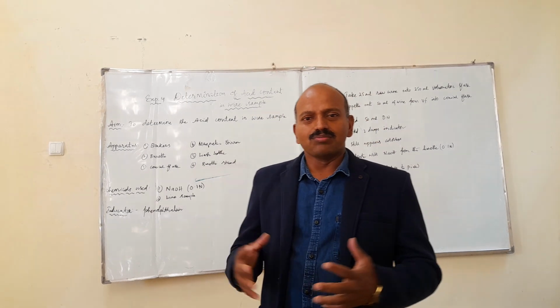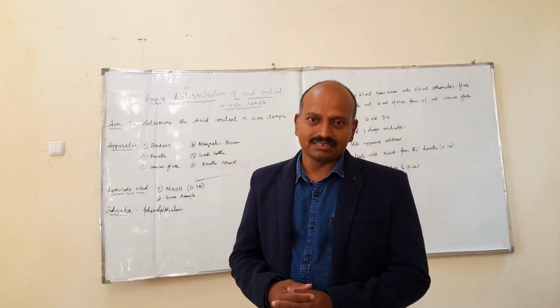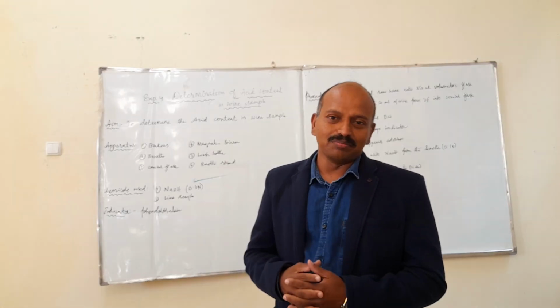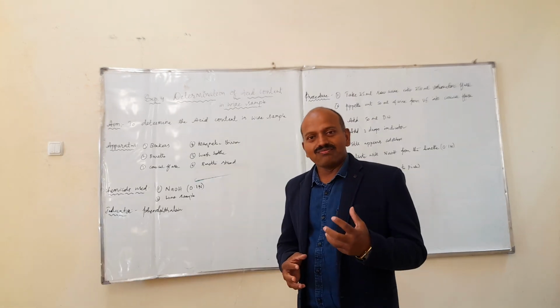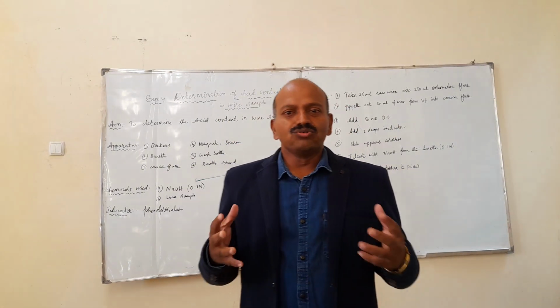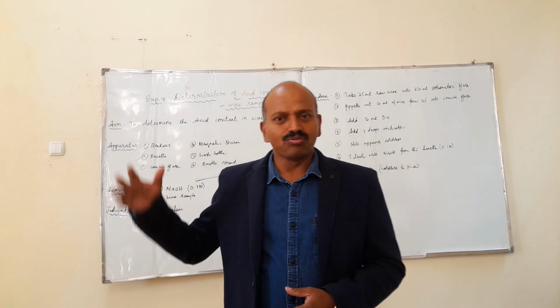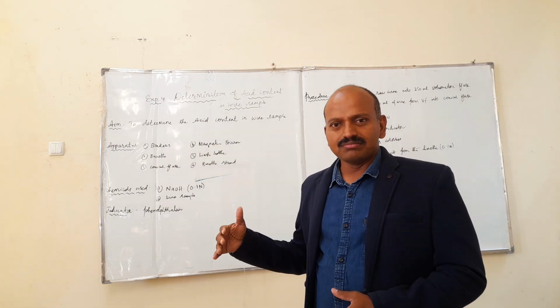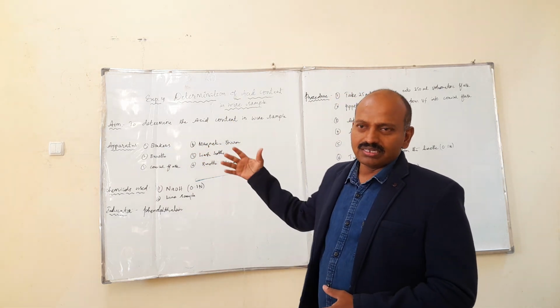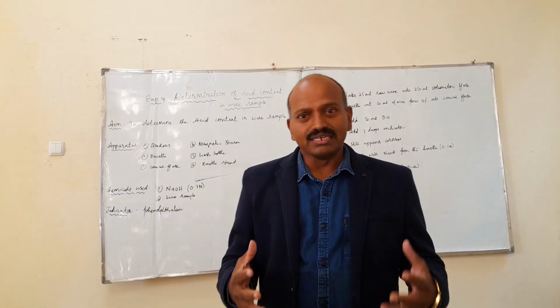So, today we'll discuss a new experiment that comes under real sample analysis. A very good and interesting experiment: determination of acid content in a wine sample. Today we will determine the amount of acid present in the wine sample. Let us see the procedure as per the system. The aim or objective is to determine the amount of acid present in the wine sample.